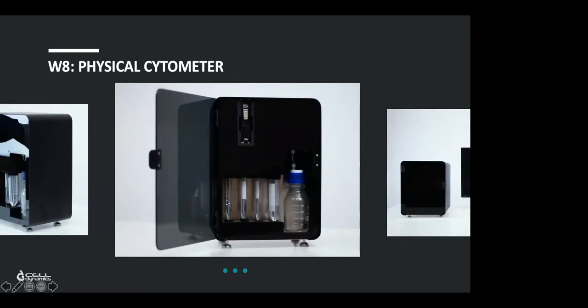Starting from the left, we have the vessel A, the first one, and the vessel B tube that are designed for collecting and sorting the target population of spheroids in the vessel A and the contaminants in the vessel B. And then we have the sample holder tube, that is the second tube from the left, that collects your suspension of spheroids and organoids under testing. The fourth tube is a 50 milliliter tube containing the weight analysis solution, that is our calibrated buffer for the analysis. And then we have the waste bottle and the 0.45 micron air filter for the air flushing in the instrument.